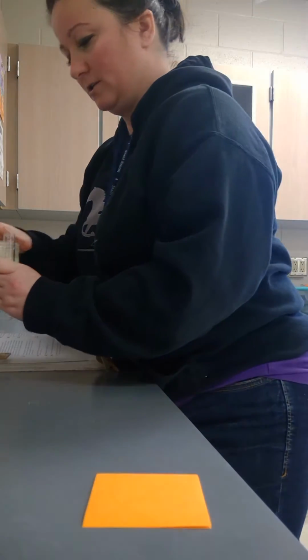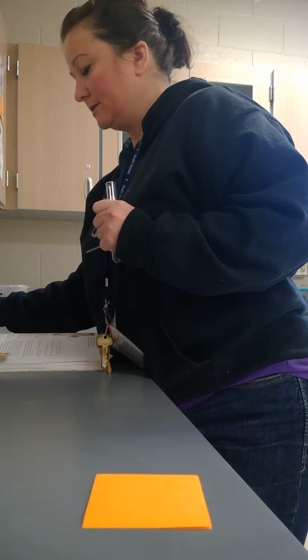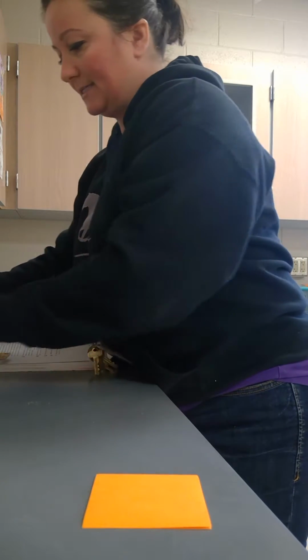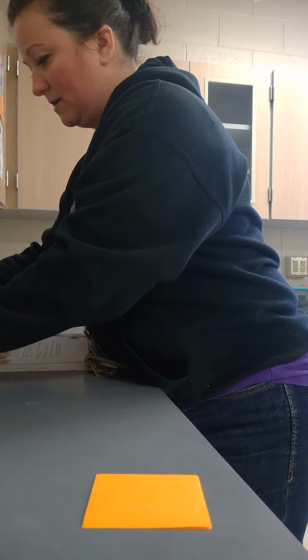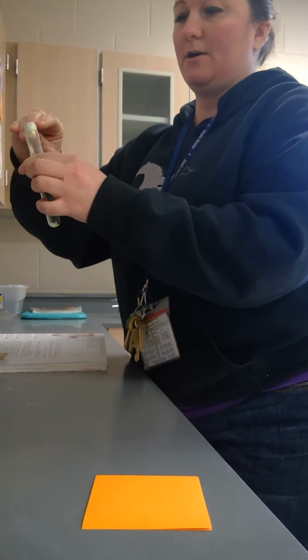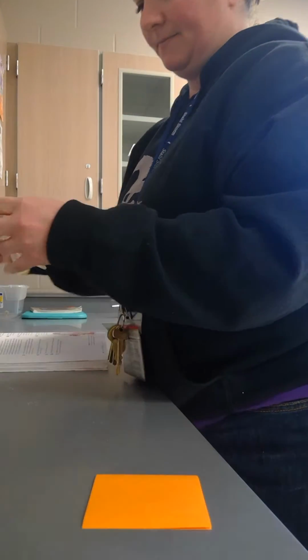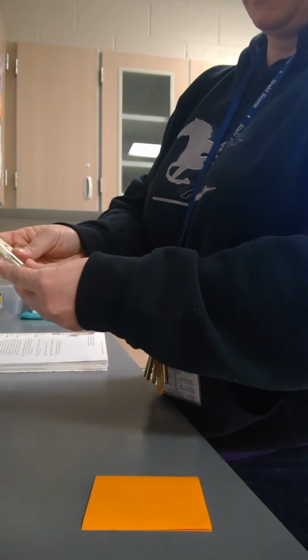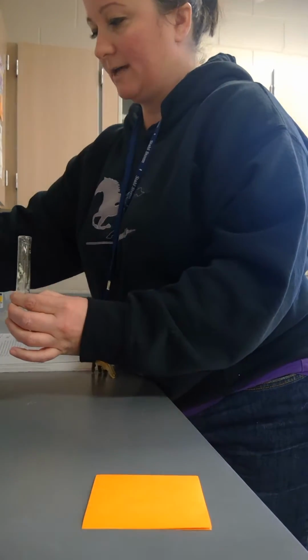And our sulfur, you can see it comes in a powdered form, and it's yellow in color. So exact same steps as previously. I'm going to take that sulfur. I'm going to get myself 1 good scoop, not overflowing, but just 1 scoop. And then just like previously, I want again the 5 centimeters worth of water added to it.